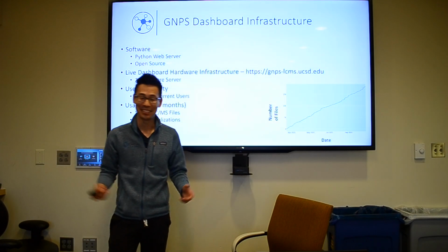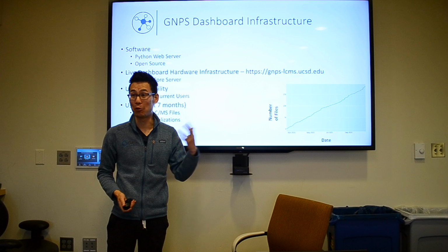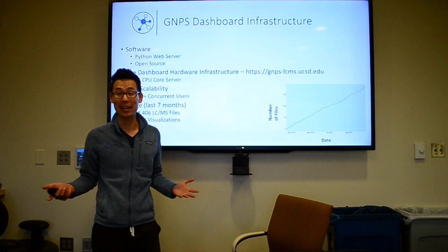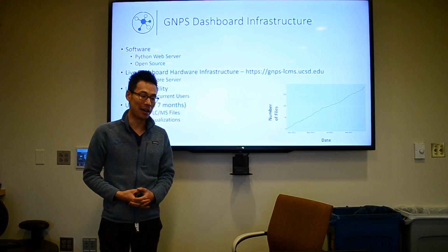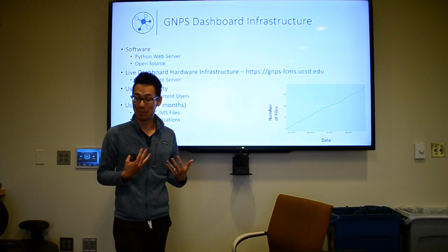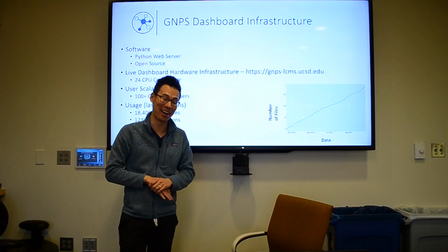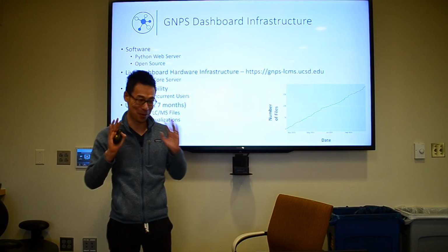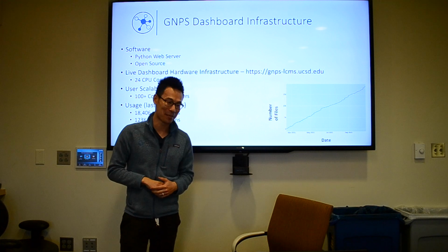Well, thank you, Danny, for giving us a good introduction to the GNPS dashboard, and why it came into existence and what the need is. And I think one of my needs initially was out of laziness too, so I want to add that to the pile. I didn't want to download data, and I didn't want to install software. So for a lot of you bioinformaticians out there, hopefully you can relate.